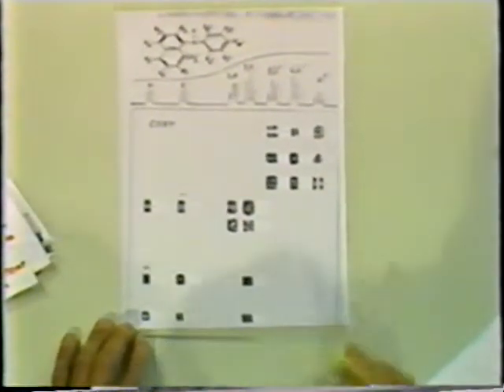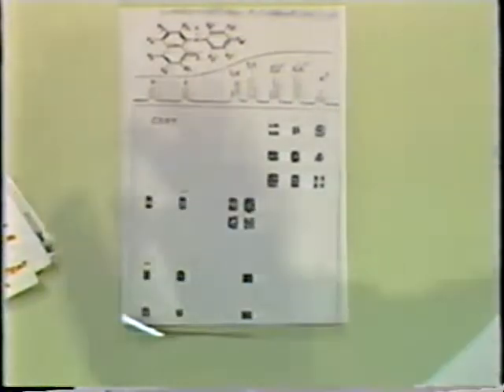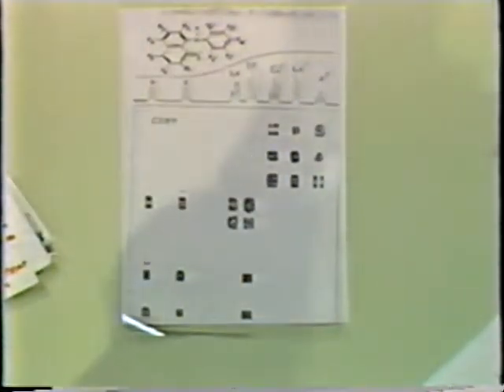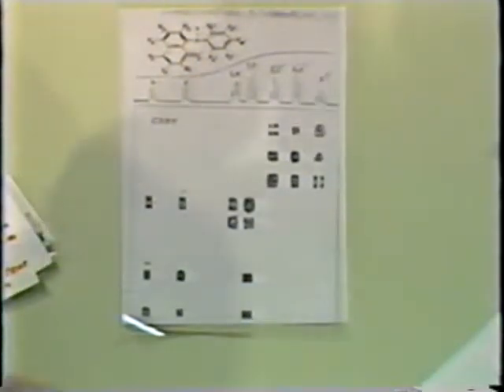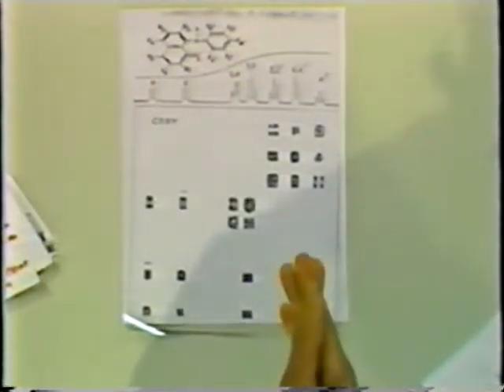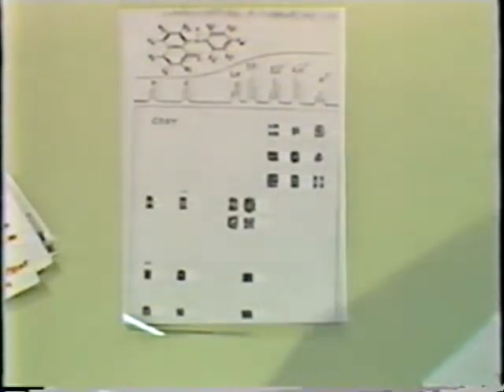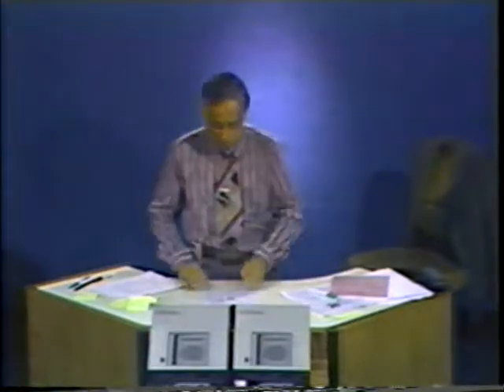We went through a very great labor just now to see why there will be a magnetization transfer from one spin to another. We have come to the conclusion that there will be a magnetization transfer if there is a J coupling between the spins, and if we resolve that. If we do not resolve it, we still will not see a magnetization transfer. The other conclusion is that the magnetization transfer is not a net transfer. It is only a differential transfer. So with this information, we can go ahead and use the COSY.